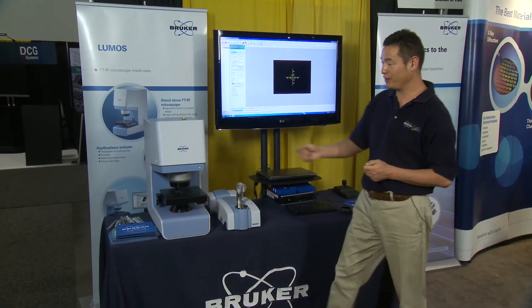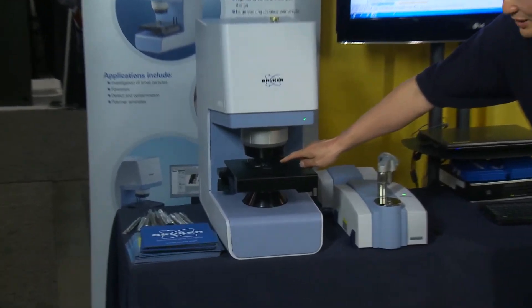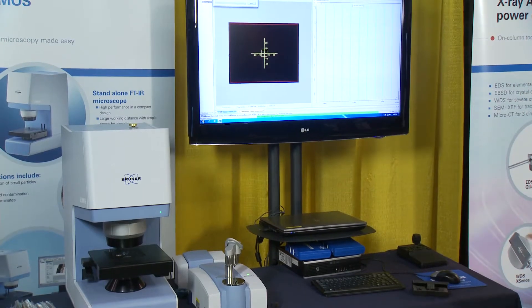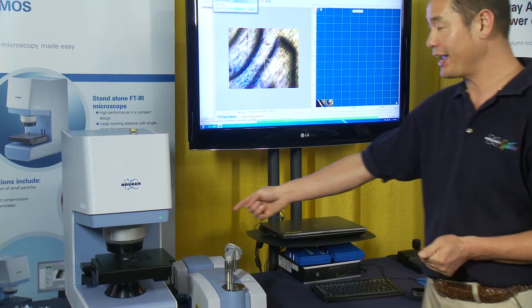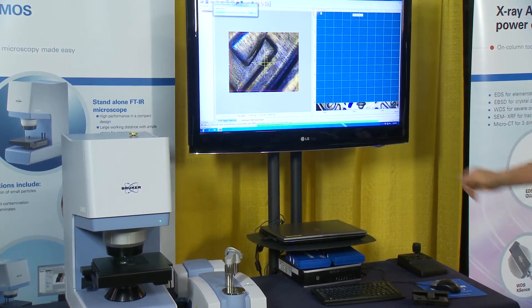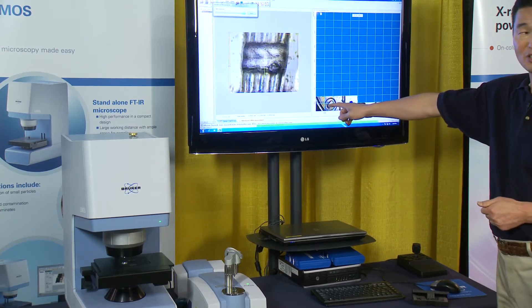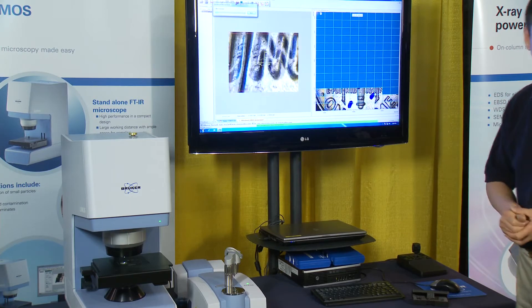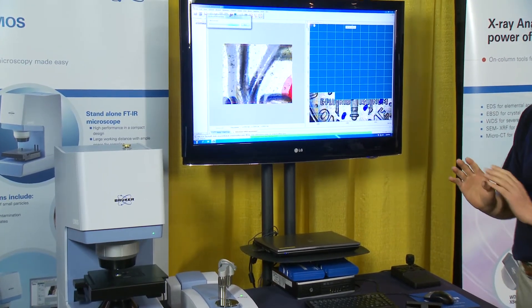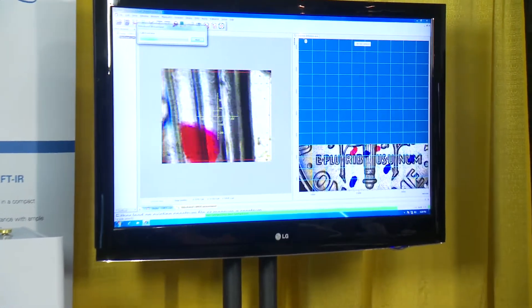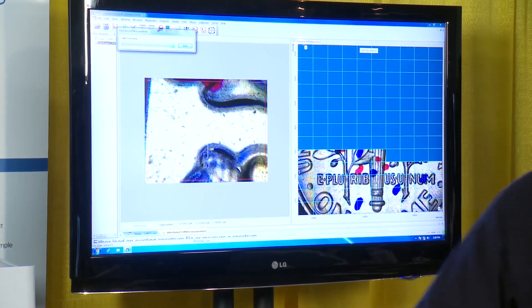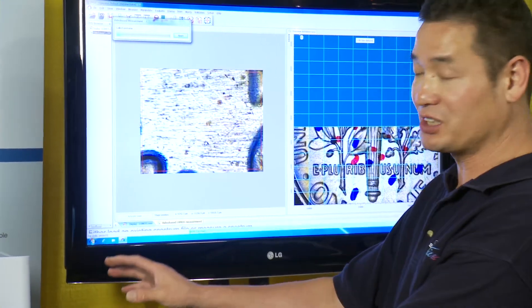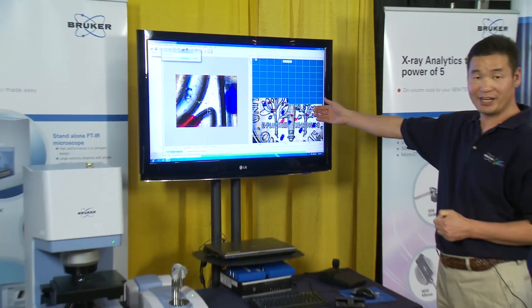The first thing you do is place the sample on the stage. I have a test sample over there — it's a dime with something on it. So let's scan the surface image first. The infrared microscope is now activated and it's scanning the surface image of this particular sample. You can see it's very high speed — every frame is stitched together to make a large visible picture of the sample. Notice the alignment is fully precise and fully automated, and the speed is very fast.